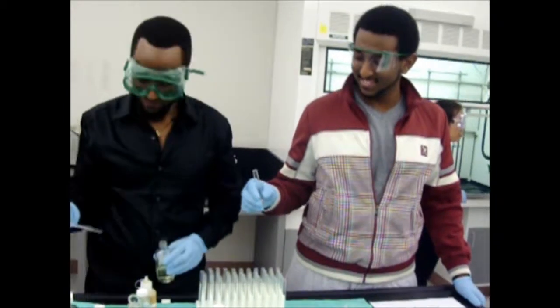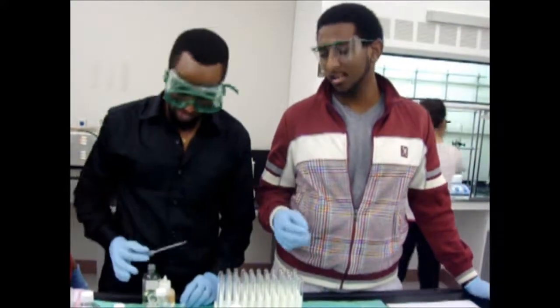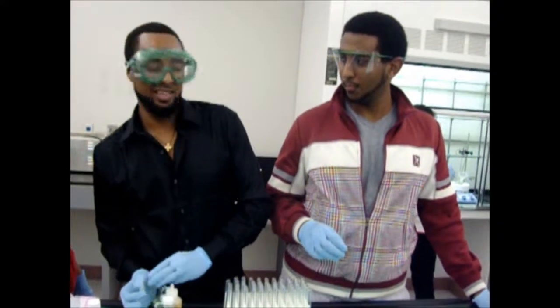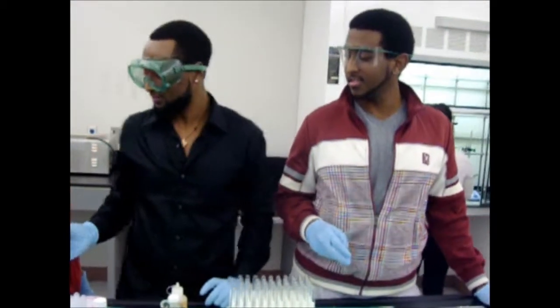Now, one of the things that you cannot do is put whatever you have remaining back into the main bottle. It will cross-contaminate and ruin your whole entire bottle. So I'm just going to throw this away. Make sure you remember that. Here you go. Toss it in the trash.